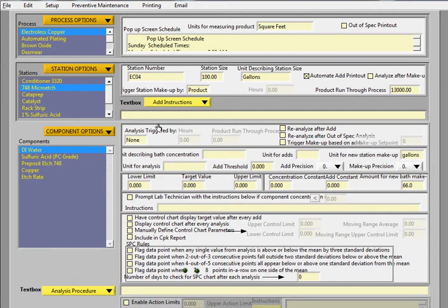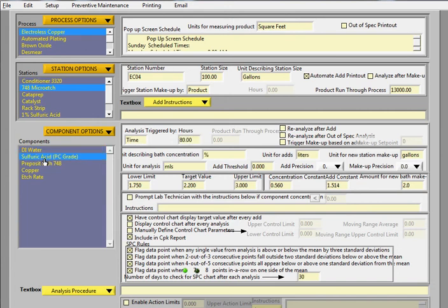The next section to talk about is the component section. And also for a component, in this case, it's DI water, sulfuric acid. So here we're triggering sulfuric acid based on time, and that's every 80 hours of production time.